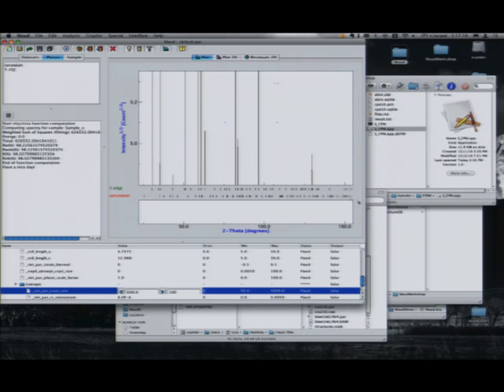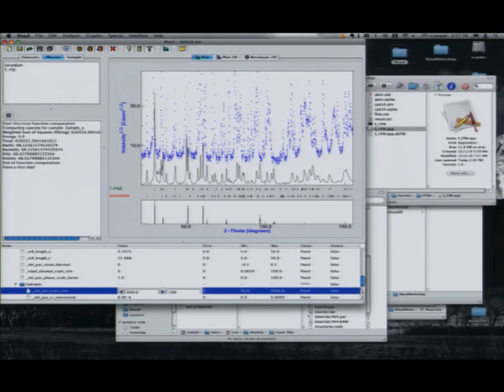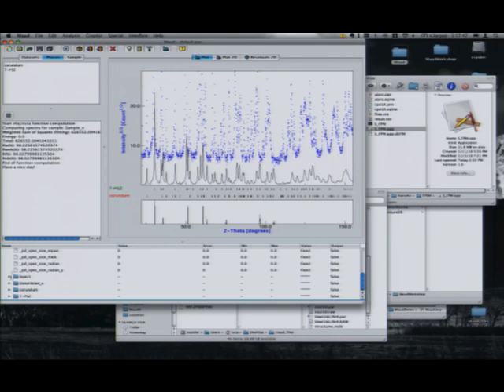Yeah, over here. Well, I actually don't know what is happening on my, oh no, yeah, they turned out. It was something strange there. Okay, here it is, so let's see. If you change the crystalline size, you see some of the peaks are broadening, okay? These are in angstrom. And in this case, for example, we don't have the correct set parameter for this one, the one I was showing.